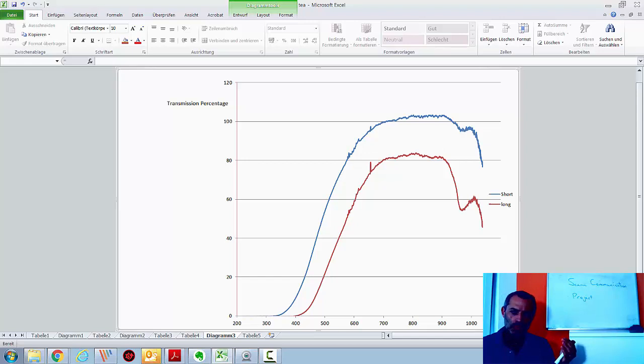So if we have a short path we get a relatively obvious step and that is neat out of the tea. If we have a long path it absorbs all the light and we see nothing. And what I'm interested in here is can we measure the concentration of the brown components of the tea quickly and easily with this method. And we probably can. We just have to choose wavelength down here at 600 or 700. Probably not 700 because 700 appears to be doing nothing. So somewhere here. Not next to that spike. So here maybe. And use that to determine our concentration of tea as a measure of how brown the tea is to give us a number. We will have to convert it to absorption units again because that is the standard for concentration. I've forgotten to draw the wavelength on again. And in this case the spectrometer goes out a little bit further in both directions. So we can also see other things happening.